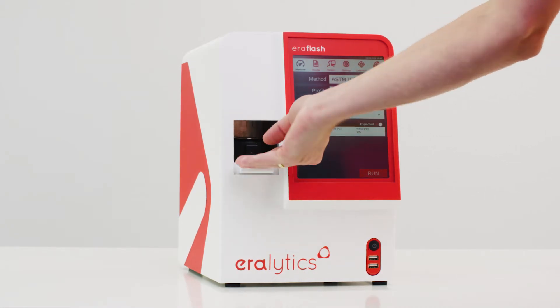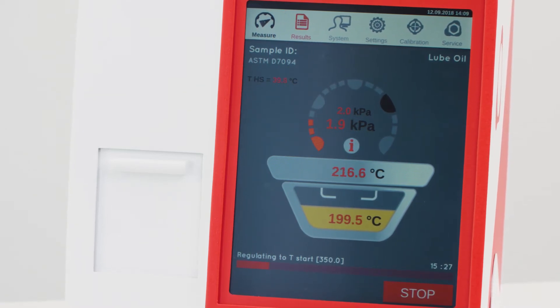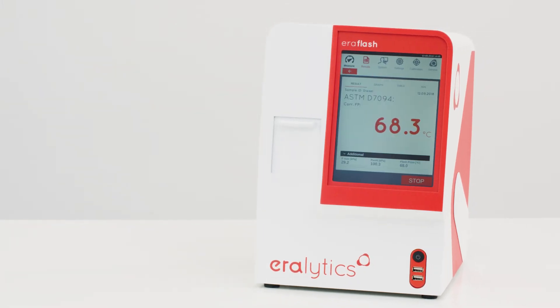eralytics' patented PBT Peltier Boost technology makes ERAFLASH the flashpoint tester with the widest temperature range and fastest heating and cooling rates on the market. As a result, turnaround times are significantly shorter than usual.